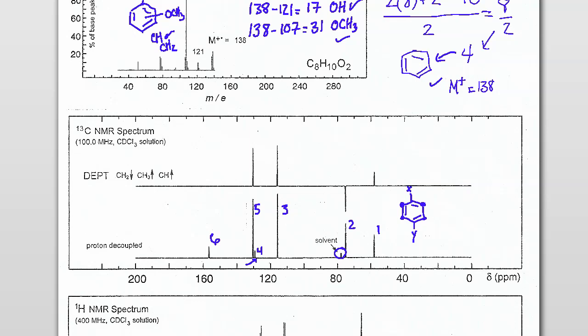So we have the aromatics, right? And then we have 2 peaks that are going to be hydrocarbons, but they will be hydrocarbons, most likely sp3 hydrocarbons, that are near electron withdrawing sources. Because look at how far downfield these are, right? We don't have anything in the 20, the 30 region.